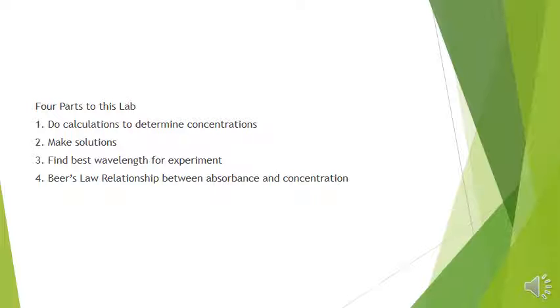The third part of what we did is that once we got our solutions, we wanted to find out, using the spectrophotometer, the best wavelength that gives us the best results. We can actually see changes, and you won't have to do anything about that, but that was part of it. You'll see that in the quiz.